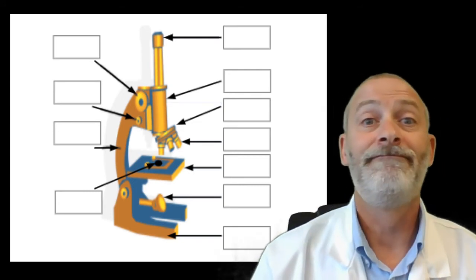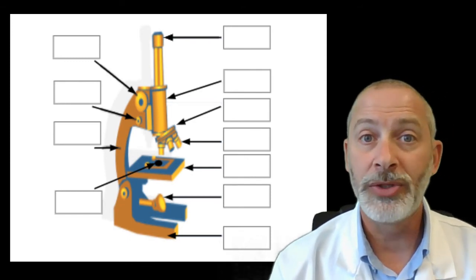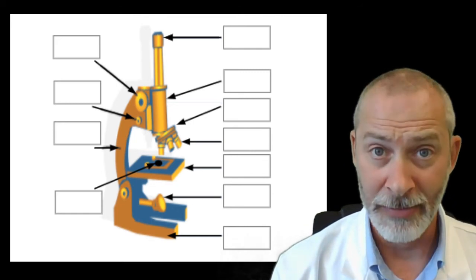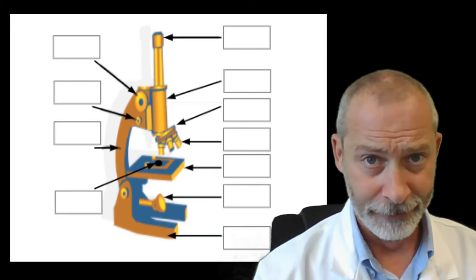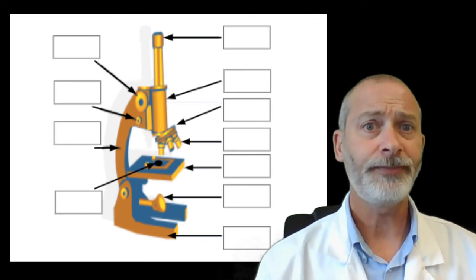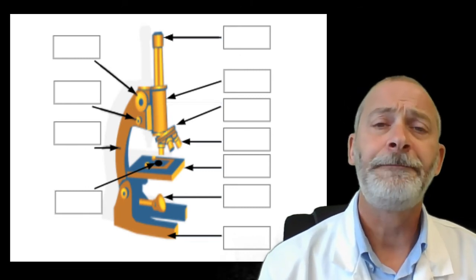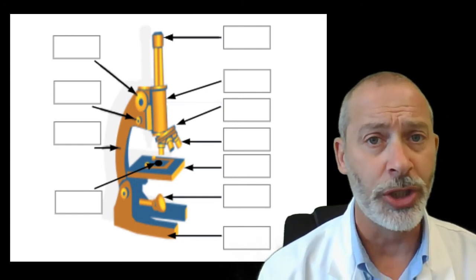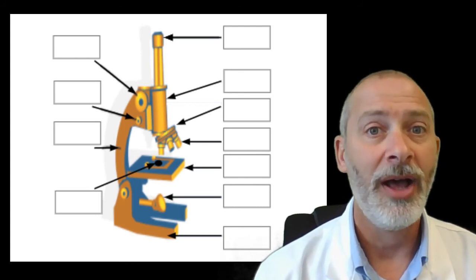Okay, now, before we move any further, tomorrow we are going to go over the techniques for actually using the microscope, and we'll do an activity together in class virtually, beginning with some very important key points to remember. But for now, we're going to end it here, and I'd like you to go back to our one-stop shopping location for science information, Google Classroom, and continue with the next item on the list.